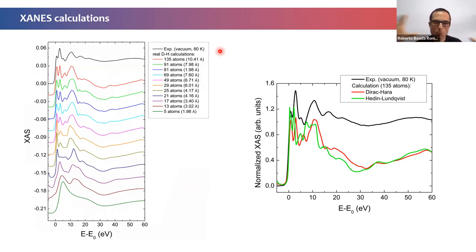So then we are not having this periodicity. With a large cluster we don't have unit cells inside the cluster. Okay, so this is more like a warning, and it is important where you cut this cluster size. Okay, so we're cutting molecules and things like that, just to have a better defined potential.